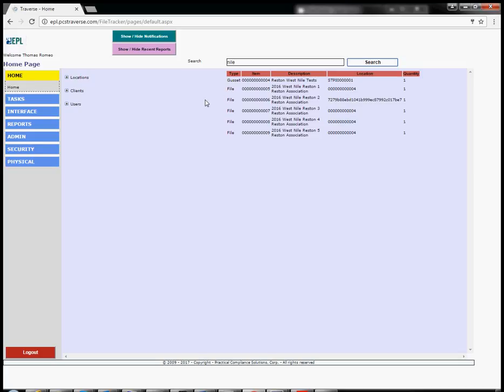So the Gusset would be one of those large green hanging folders that you put inside a file cabinet, and then each of these files would be inside that Gusset. And again, everything here is for demonstration purposes. You know, you can configure the system many different ways.